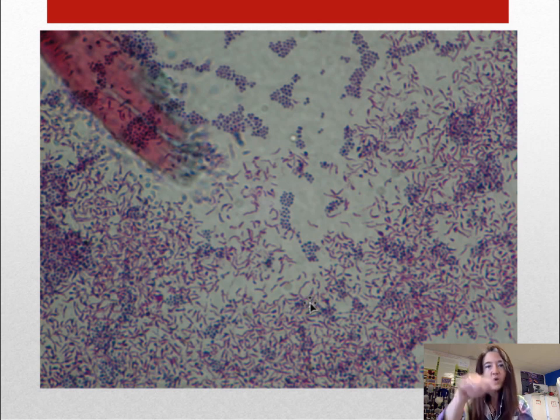And if you did a good job of really mixing your smear, you might see individual rods. Otherwise, you'll see big clumps of pink where the mycobacteria have all clumped together. And then your non-acid fast cocci that are the Staphylococcus epidermidis that you stain, non-acid fast, they let go of that acid fast primary stain.